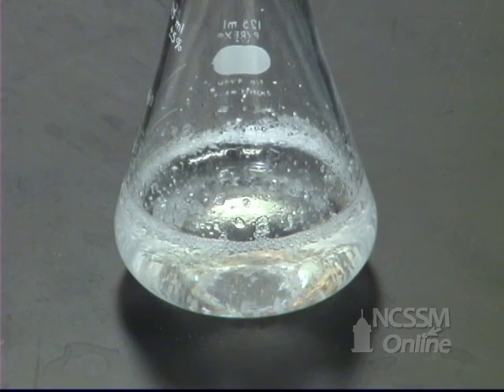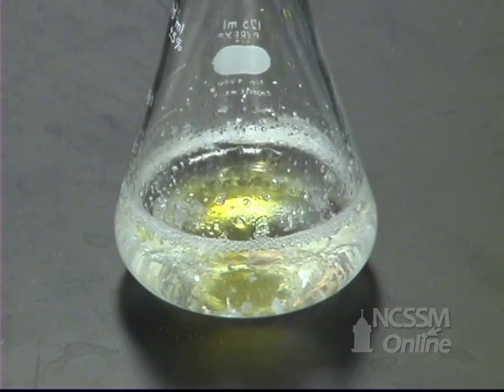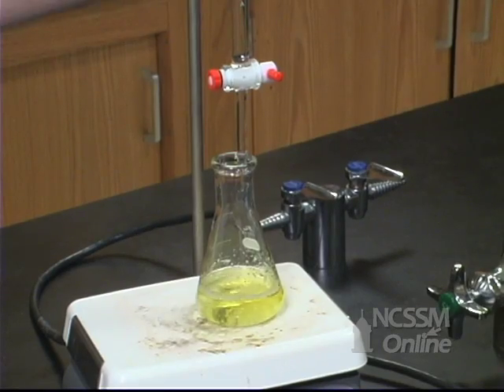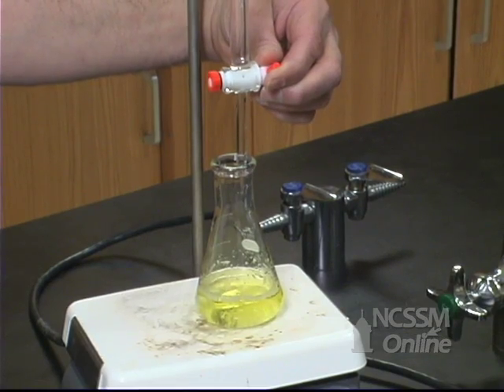We're going to add a few drops of bromophenol blue indicator to the reaction mixture. Bromophenol blue is yellow in acidic solution and blue in basic solution. We're now going to titrate the excess HCl with a standardized solution of sodium hydroxide.